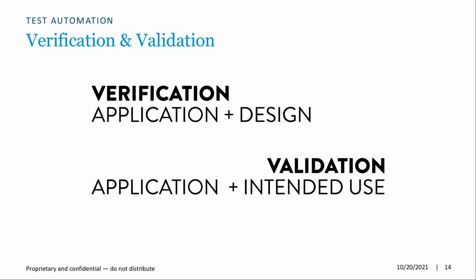On your side, when it comes to implementing a product, primarily you're usually focused on validation. Verification can be done, but normally it's only done if you've made changes, something you just want to verify, a design change that you may have made. So that's just some background on what it is that I do here.